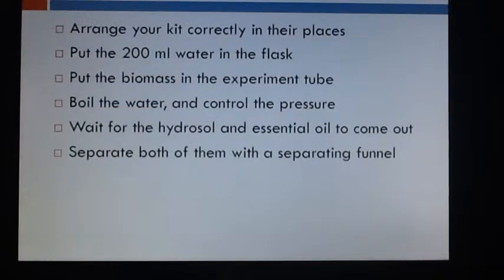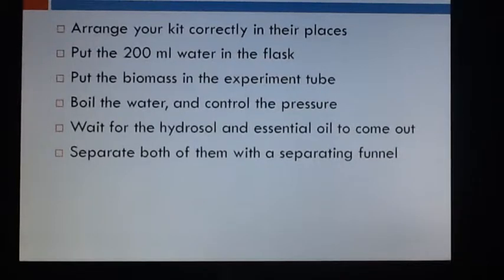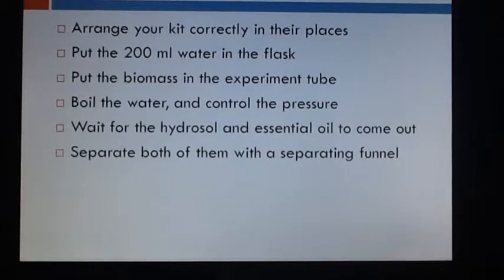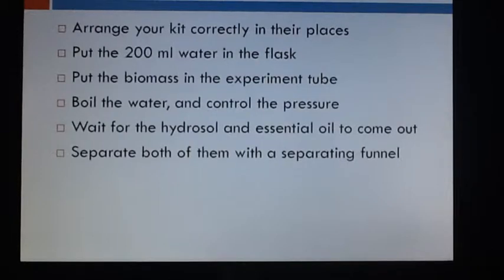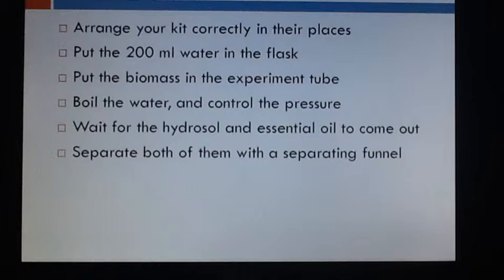So we're gonna talk about the methodology next. First, arrange or put your kit in its correct places. You can search for images on the internet and arrange them. 2. Put the 200 milliliters of water in the flask. 3. Put the biomass in the experiment tube. 4. Boil the water and be careful not to turn the heat up too high because it will increase the chance of blowing up in your face.